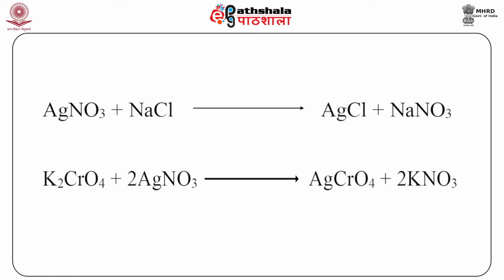In this method, 100 cm³ or 100 ml of water sample is taken and its pH is adjusted between 7 to 10 with sulfuric acid or NaOH, and 1 cm³ of 5% potassium chromate indicator is added. The sample is titrated with 0.0282 normal silver nitrate solution until a pink color is obtained. Silver nitrate reacts with the chloride in slightly alkaline condition and this gets precipitated as AgCl, and this you can see as it is shown in these equations.